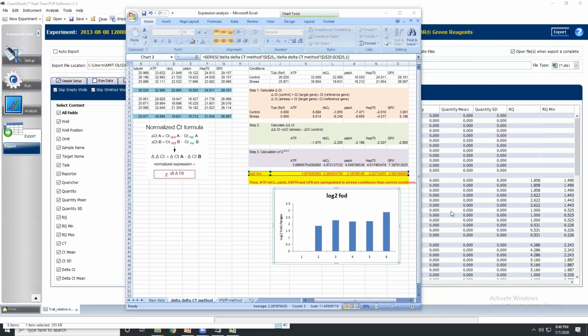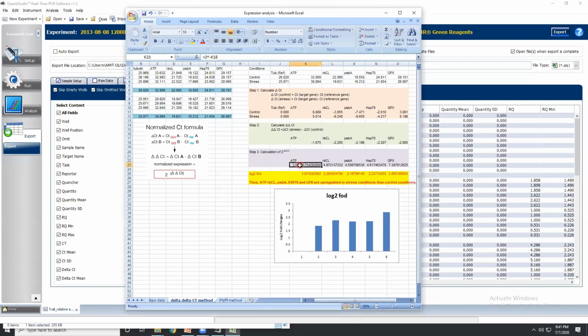Okay, okay. So log fold change is a way how you represent the difference in the expression values. So basically, when you are calculating the normalized expression, the relative expression can be found as 2 to the power minus delta delta CT. So 2 represents your fold change. Whatever result comes, that's your relative normalized expression. And in order to make it uniform in the log fold, you represent it as log base 2 fold change.